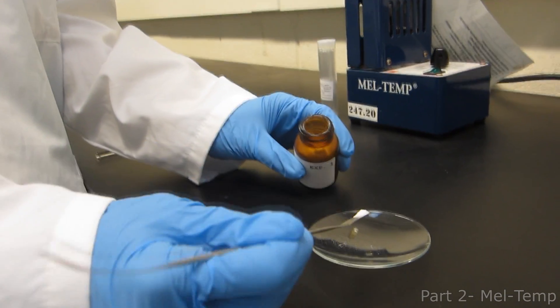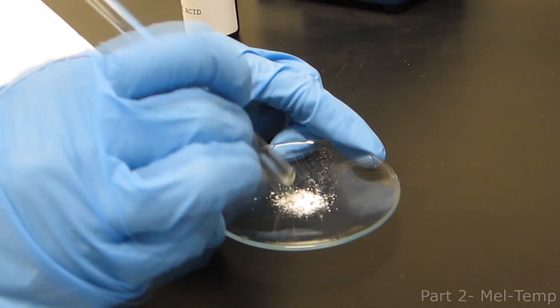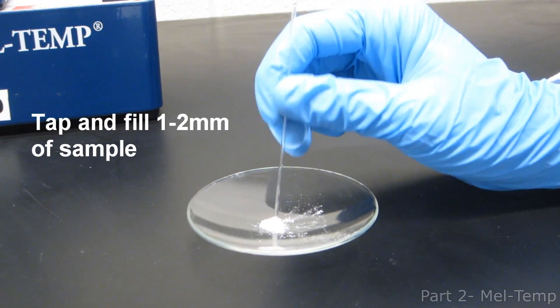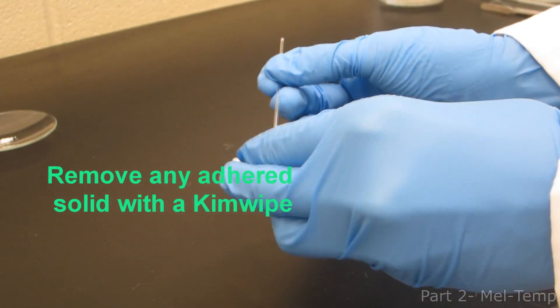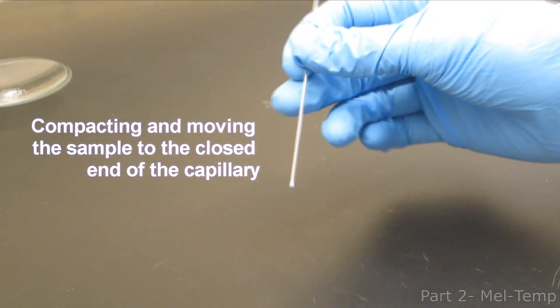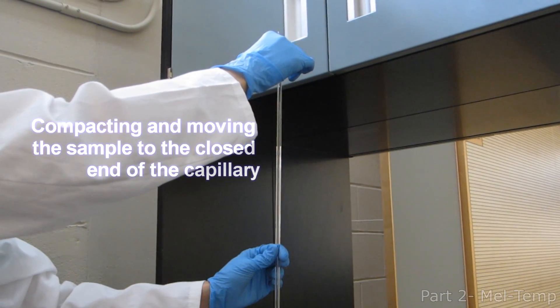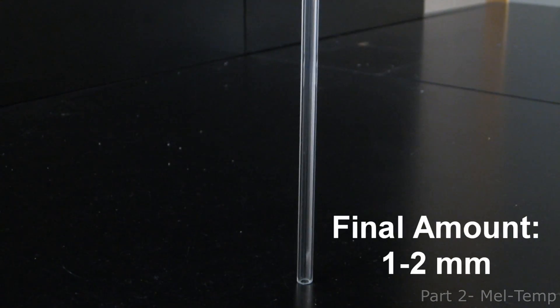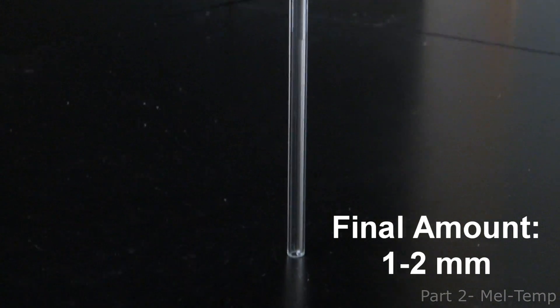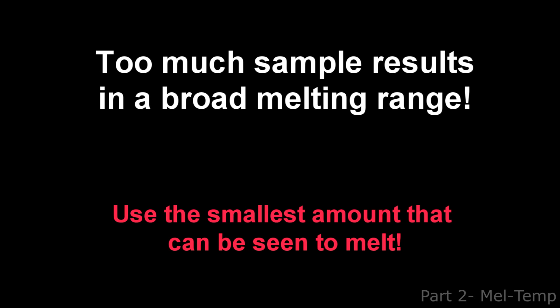Place a small amount of sample on a wash glass. If the sample is not already crushed, do so with a glass rod or spatula until it is a fine powder. Tap the opened end of the tube into the sample, filling it about one to two millimeters. Carefully turn the tube over and remove any solid adhered to the outside. To compact and move the sample to the closed end of the capillary, carefully tap the tube on the bench top. You may also drop the capillary sample-side down into a larger glass tube to compress the solid quickly. The final amount after compaction should be about one to two millimeters — if there is much more, your melting range may be broader than expected.